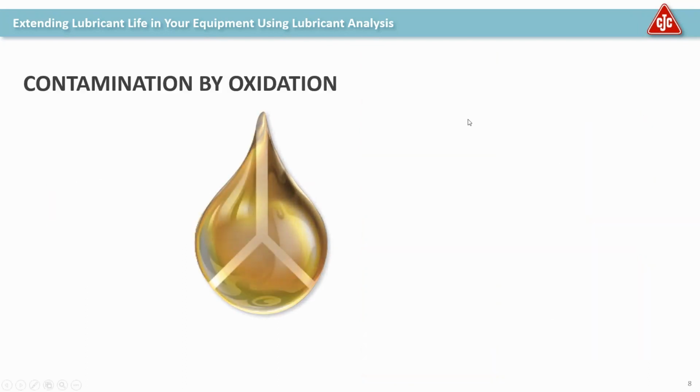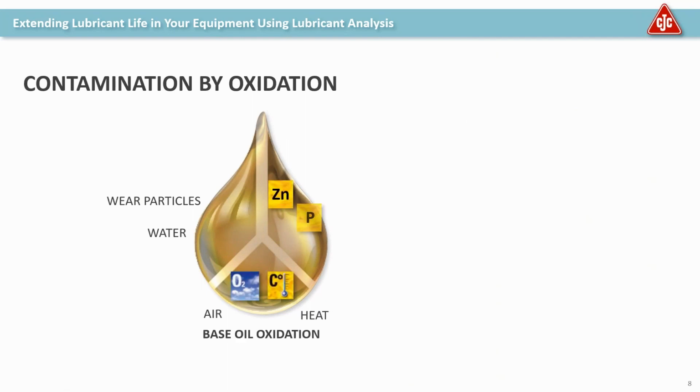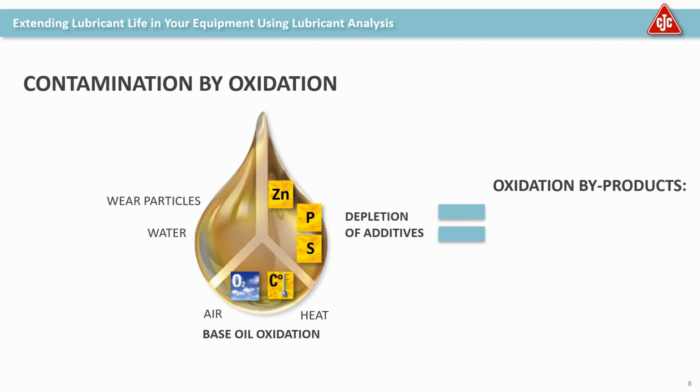As we look at the oil, of course, particles and water are important to focus on, but there's other things that we can look at that really help us to get the whole story of what's happening with the oil. Now, if we look at the upper left there, the oil drop, the particles may be what we consider normal.